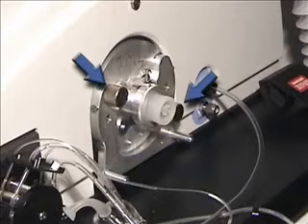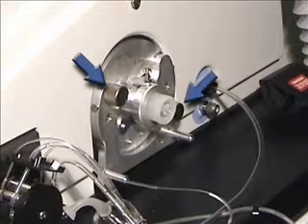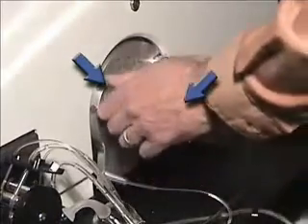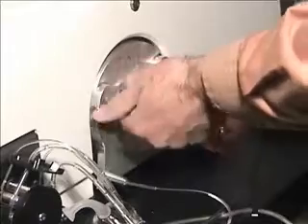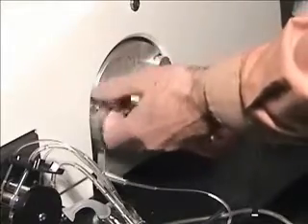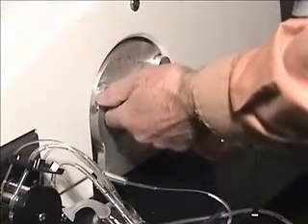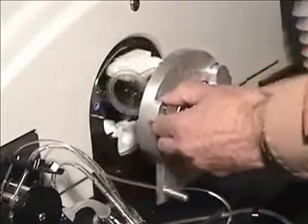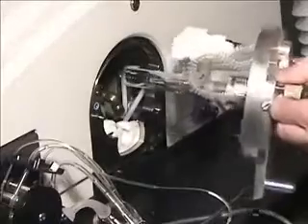Before removing the torch assembly, make sure the plasma is off. Remove the torch mount by loosening the two thumbscrews located on either side of the torch. Turn the thumbscrews in a counter-clockwise direction and slowly remove the torch mount assembly from the torch box.